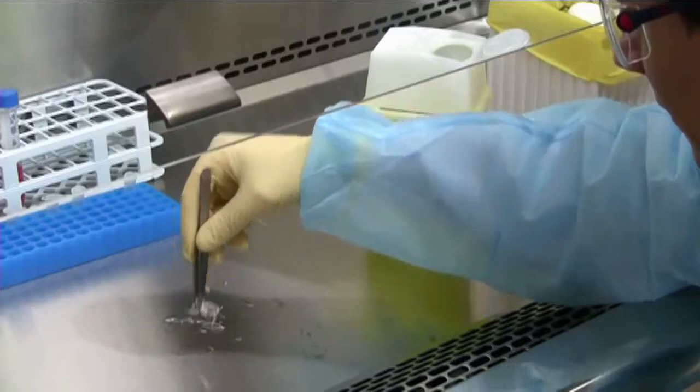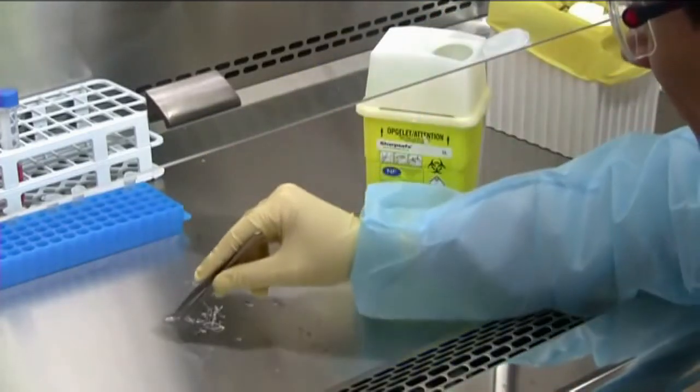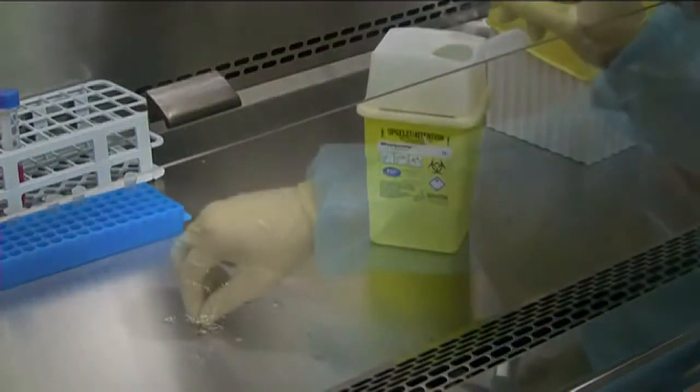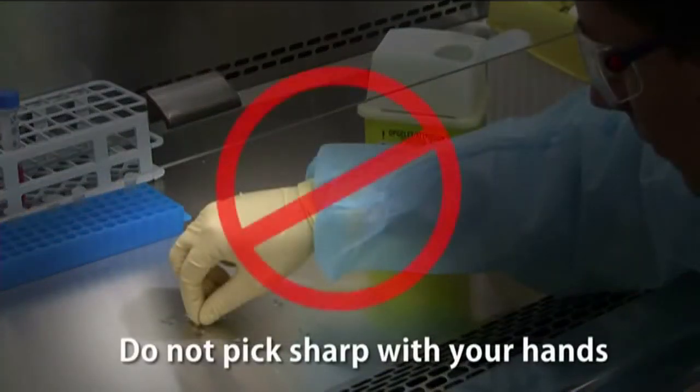If there are any sharps such as broken cryoampules, pick it up with a pair of forceps or another instrument and place it in the sharps container. Never pick up sharps with your hands.